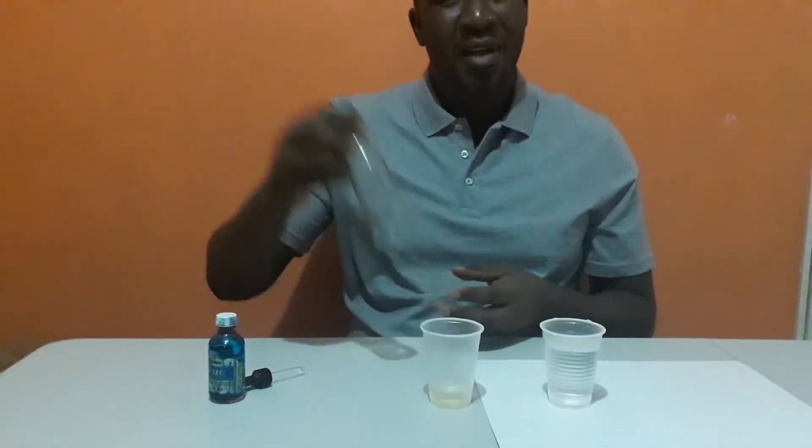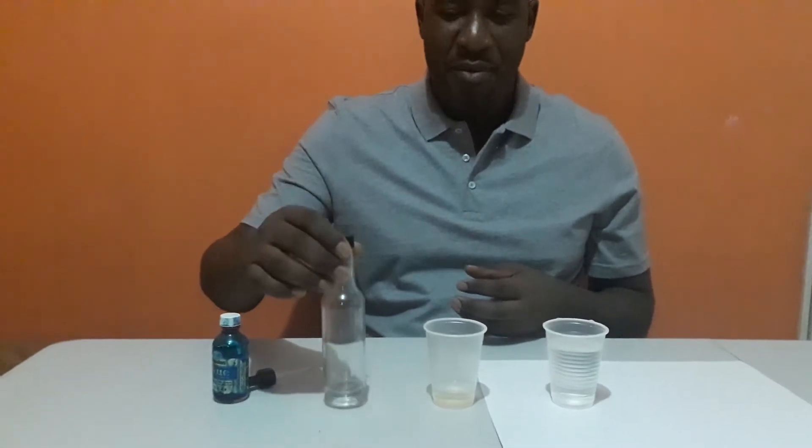I'm going to be using a plain glass bottle for my separatory funnel. This is solvent extraction under quarantine. And today, I'm going to be extracting a blue dye from a blue dye and oil solution.